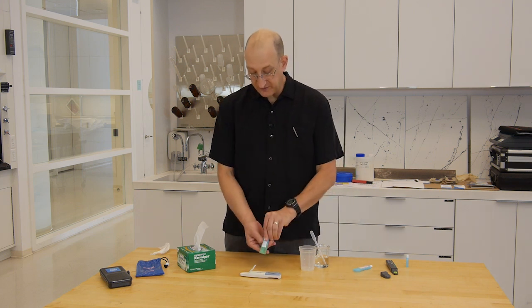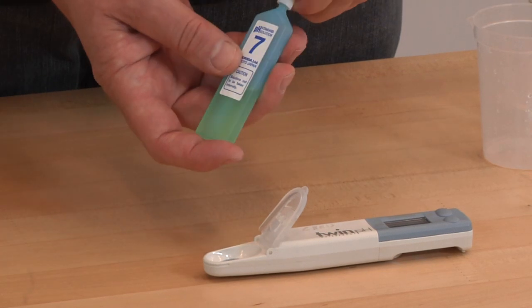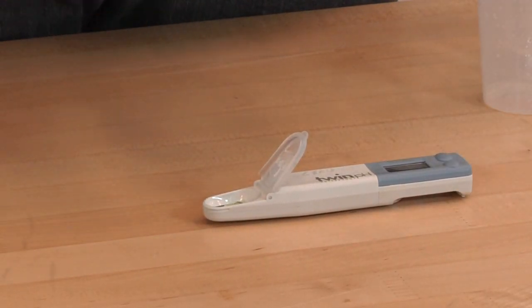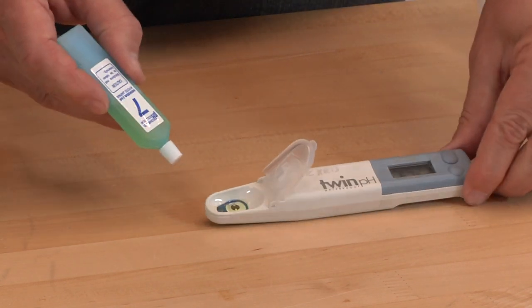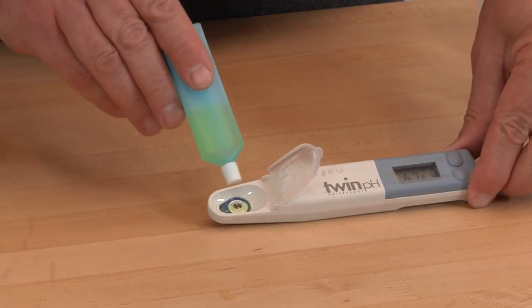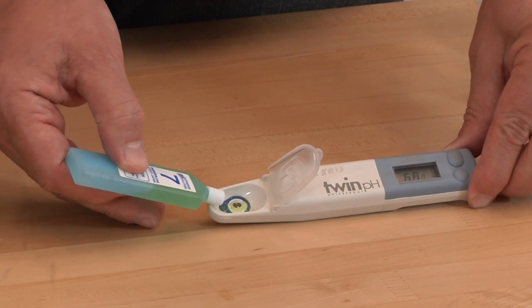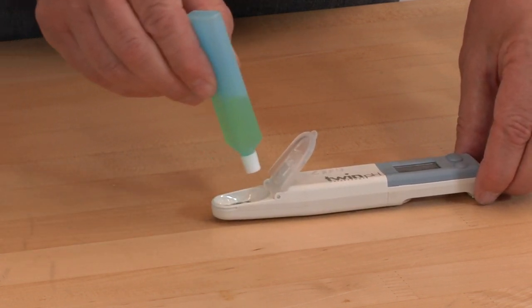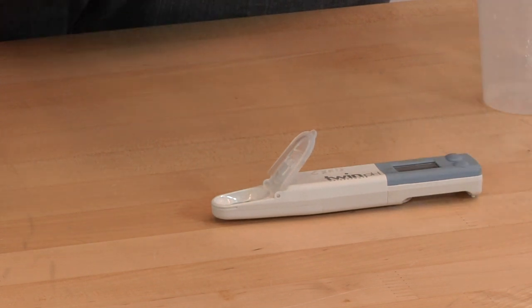We calibrate at pH 7 first with the calibration solution that came with the meter. We want to put enough solution in that we have both the reference electrode and the measuring electrode wet and connected by the liquid. So the measuring electrode is here. The reference electrode is that little white spot, and we want to have our solution connecting both.